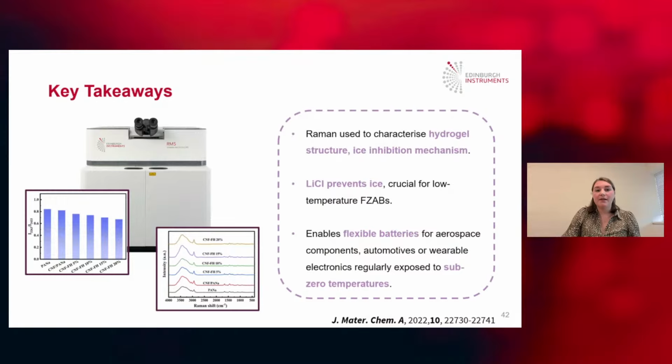So just to summarize, they were able to use Raman to characterize the hydrogel structure, as well as how this inhibits the ice forming mechanism. They saw that the lithium chloride prevented this ice formation, which is crucial for these flexible zinc air batteries to be used at low temperatures. And understanding the mechanism behind this, which Raman was able to do, enables them to develop more flexible batteries for aerospace components and things like wearable technologies that are to be used at sub-zero temperature.